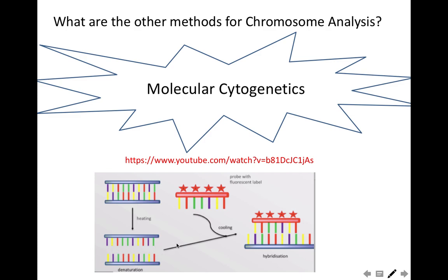And when you break these hydrogen bonds and cool down the temperature, the probe can stick again by base complementarity. The probe, because it is smaller than the other strand of the DNA, will easily bind by base complementarity again to the complementary segment of the DNA.